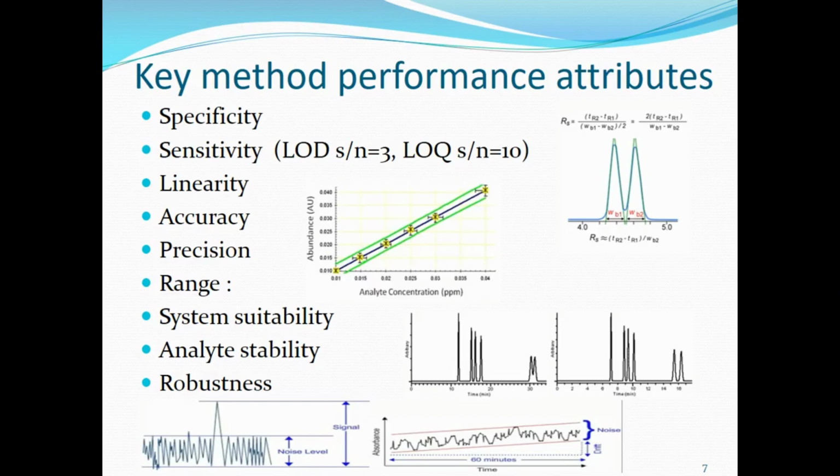Analyte stability, normally we look at the stability of the analyte once it's in solution and prior to analysis. So we look at the introduction of degradants or additional peaks over a period of time, say 24 hours, when you're holding your sample on the bench.